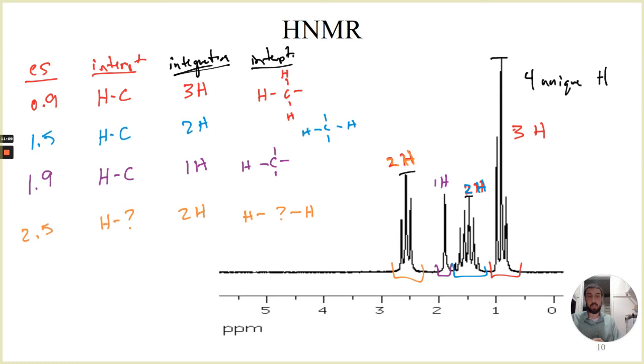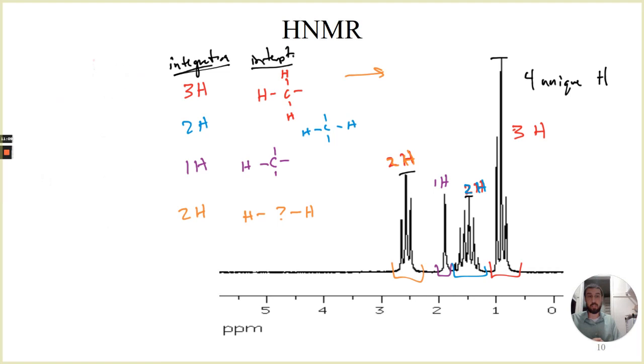Because I'm running out of lateral space, I'm going to backtrack and delete the chemical shift interpretation from this. Okay, so we're still constantly scrolling to the right. I just want to make sure you're aware of that.